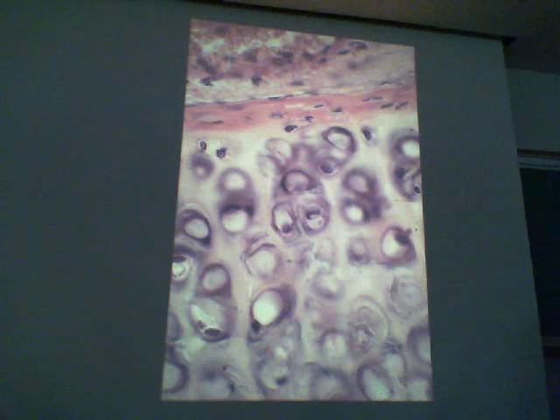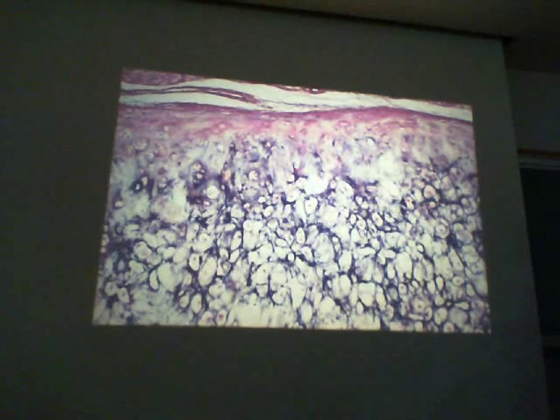And this cell that we see right there, what is that? Chondrocyte. And the chamber in which that is residing is called a lacuna, right? And this would be what? Isogenous group. And when you see kind of a difference in staining, that would be what? Territorial matrix. And the only reason it's called that is because it stains a little differently. Is it the lighter? Darker. The darker. Yeah.